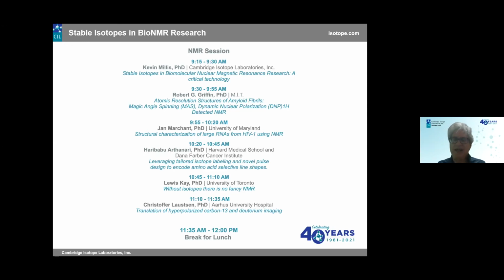It seems to have become more prevalent lately, and it's because fluorine has a very large available chemical shift, and its chemical shift is extremely sensitive to its environment. And one can look at long-range couplings. I think Mei Hong has shown this recently, where one can get quite long-range information using fluorine.